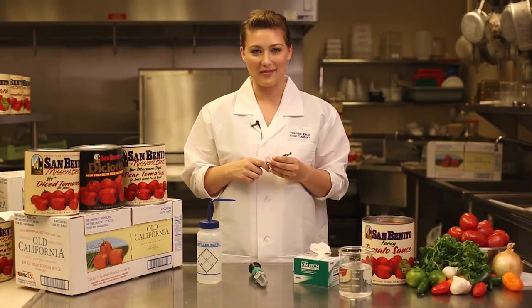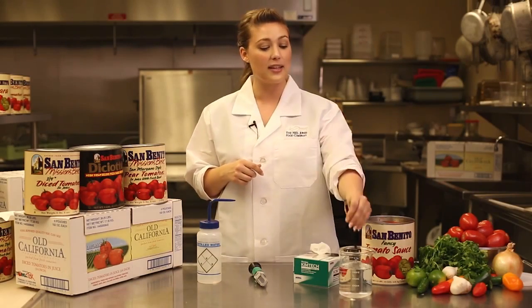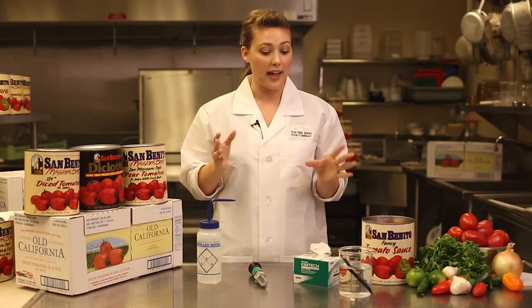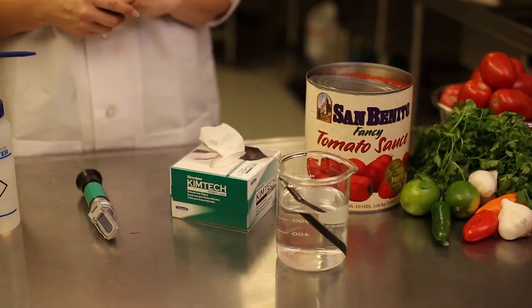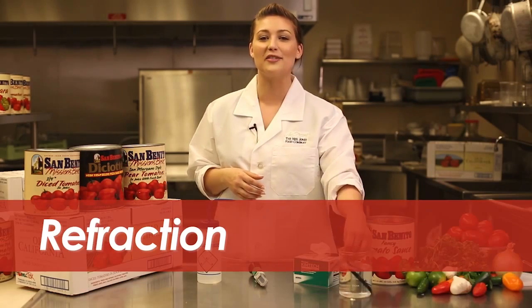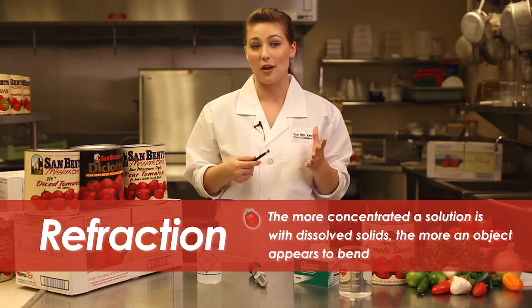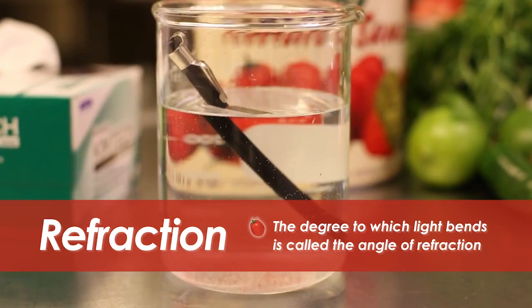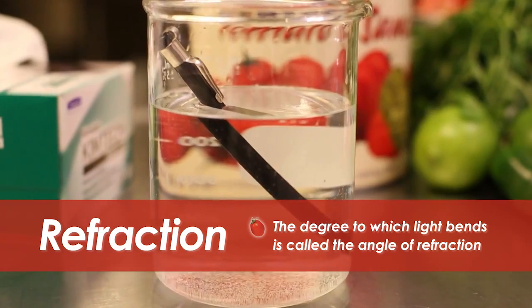Here's how it works. When you take an object like a pencil and place it into a glass container with water, the object appears to be bent. Since light bends when it enters a solution, it creates the effect that the object is also bending. This is called the refraction of light. The more concentrated a solution is with dissolved solids, the more an object appears to bend. The degree in which light bends is called the angle of refraction.